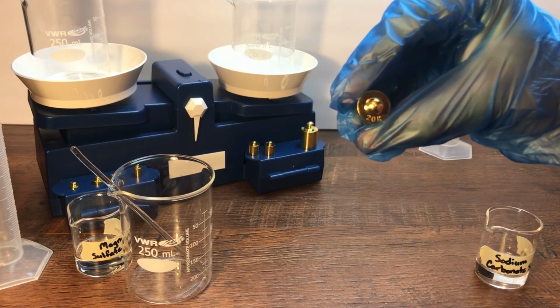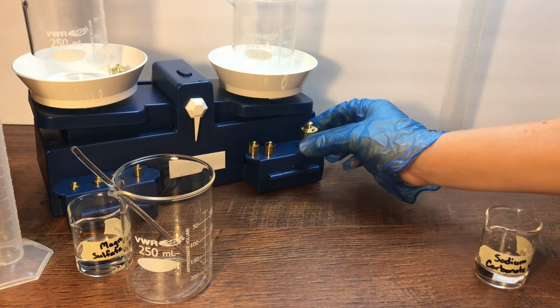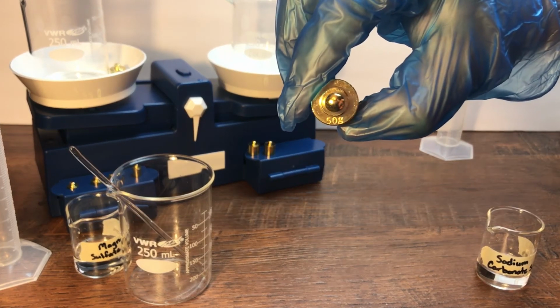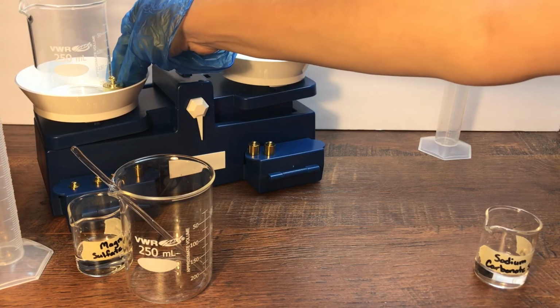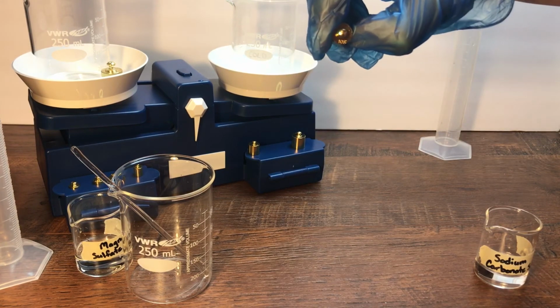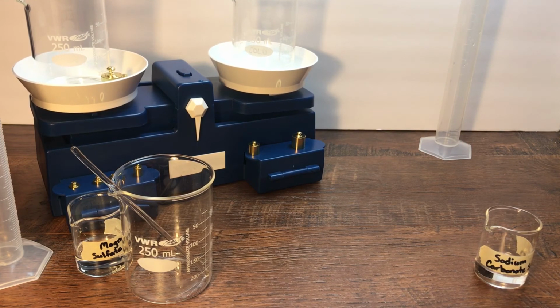So I'm going to start with my 20 gram. Next, let's try the 50 gram. It's pretty heavy. Well, that was too much. Let me take the 20 gram away. Let's try the 10 gram. There we go. Looks like our solution is about 60 grams. Now you should have all the data you need to complete the Analyze and Conclude section for this lab.